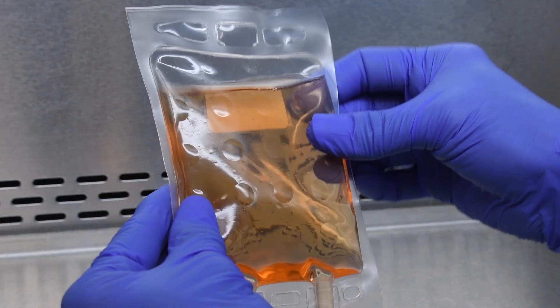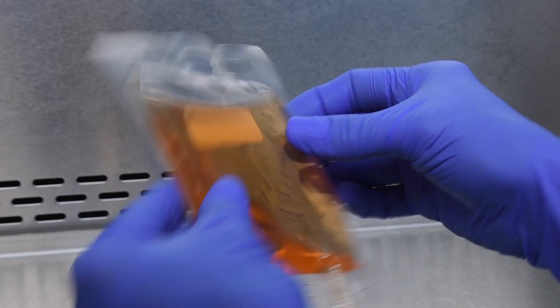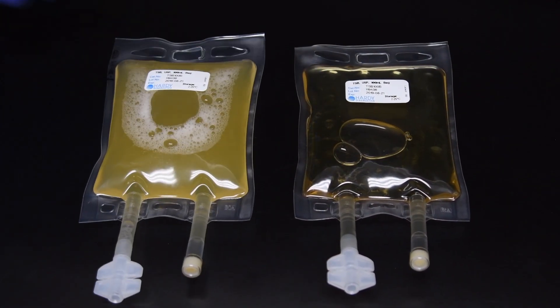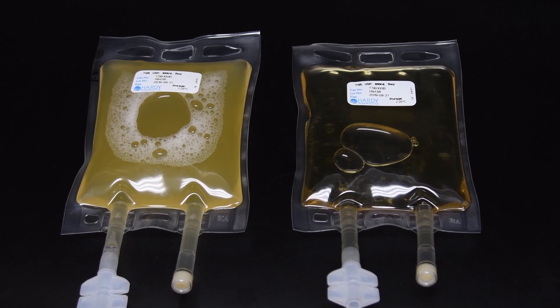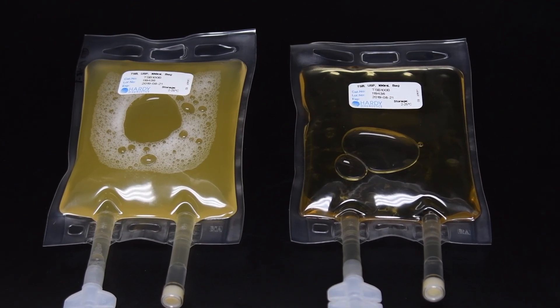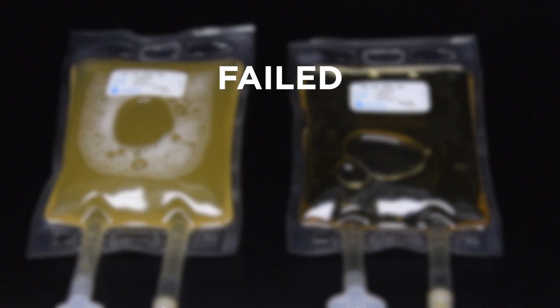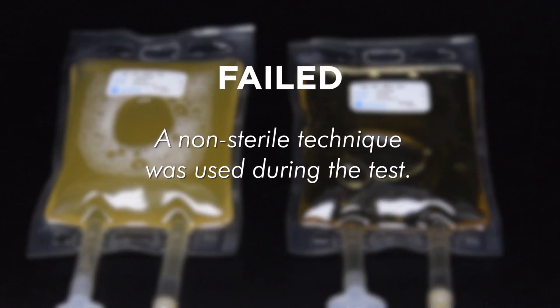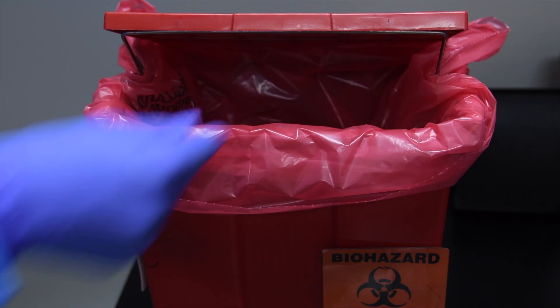Examine every few days for the presence of turbidity or growth of microorganisms. Visible growth or turbidity seen on or before 14 days of incubation is a positive test for the presence of bacteria. The media fill challenge test has failed and indicates that a non-sterile technique was used. At the end of 14 days, record the results and discard the test as needed.